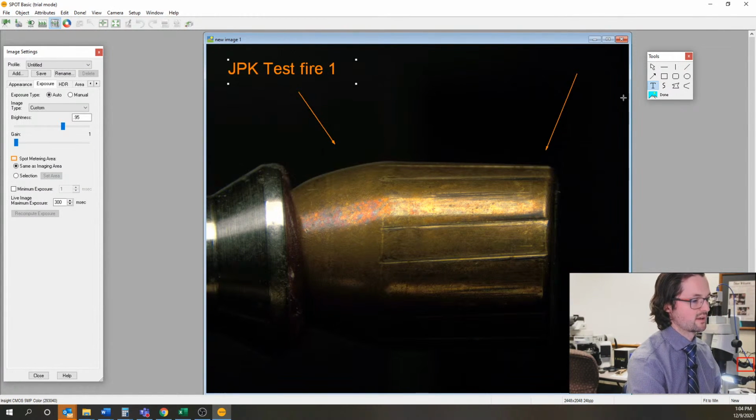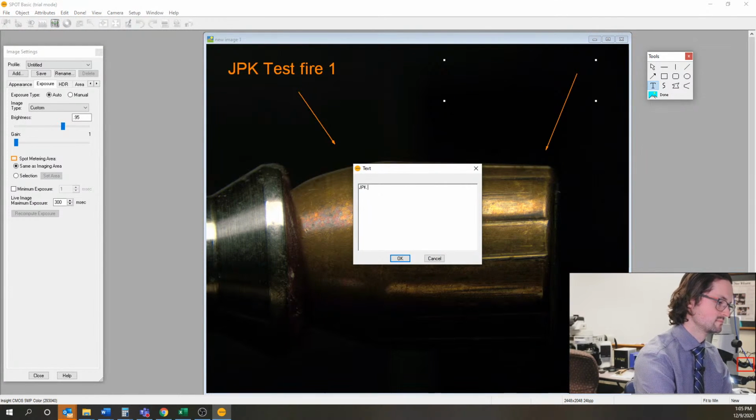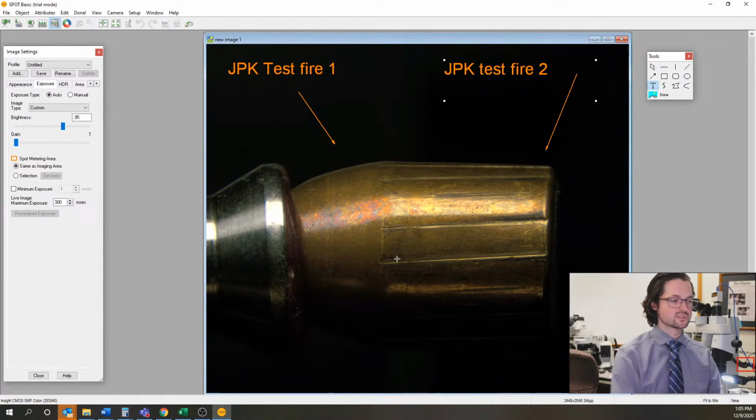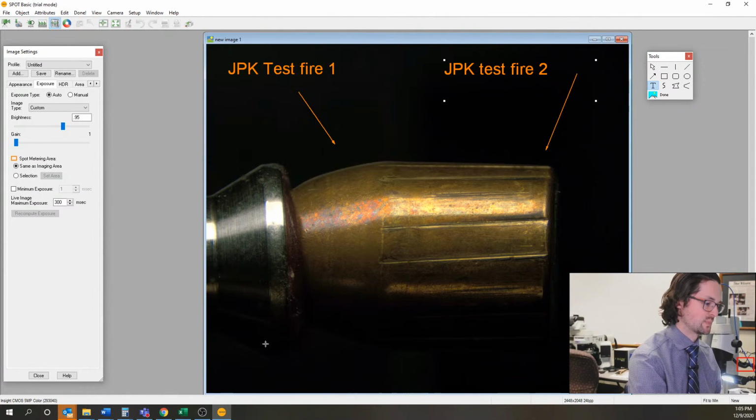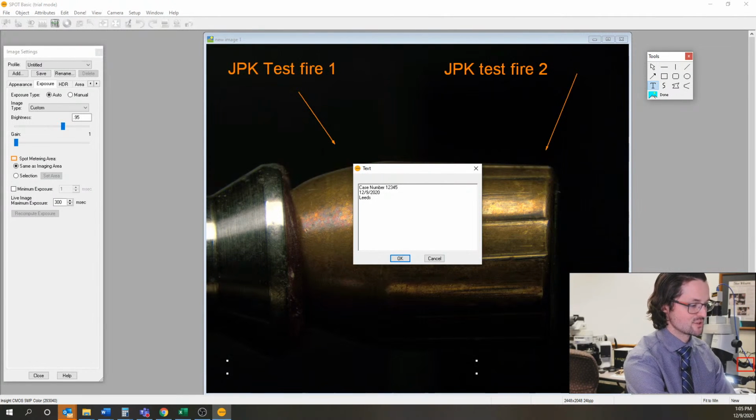And then we're going to go ahead and create another text box over here. And you'll notice that with text box mode, it keeps drawing text boxes. So I can keep making things. So if I wanted to come down here and put in today's date or case number 1, 2, 3, 4, 5, maybe today's date. And then why not just put the name of Leeds, because we're a forensic company, or a forensic lab apparently now.